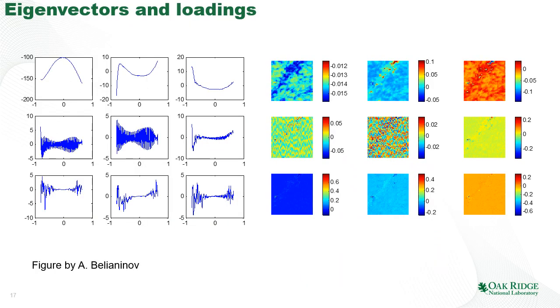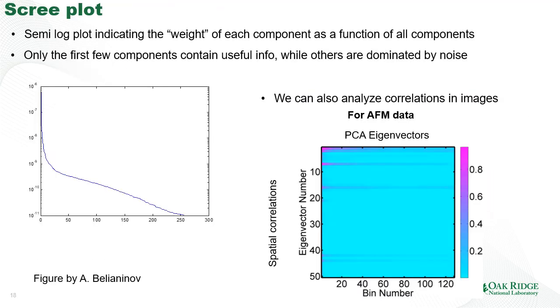In the previous dataset, we made a judgment that these components are important because they clearly show features that span multiple atoms. We can formalize this by calculating, for example, the spatial correlation functions and plotting the spatial correlation function as a function of the distance.